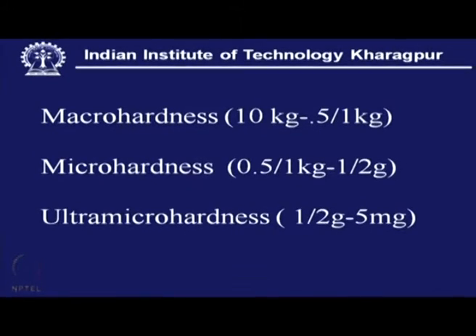That means the material is created by some metallurgical process, and after that we should assess its bulk hardness, and in that there are standard processes like Brinell hardness testing or Rockwell hardness testing.